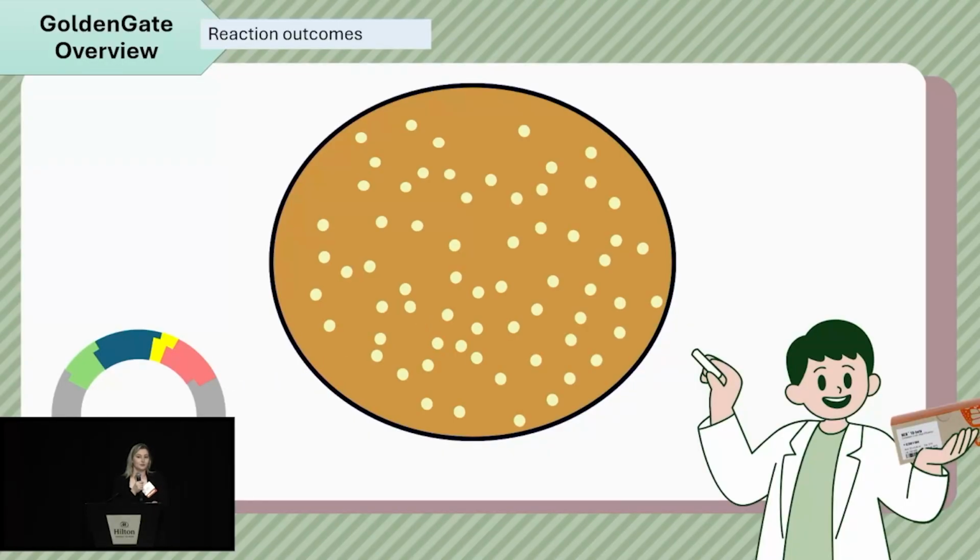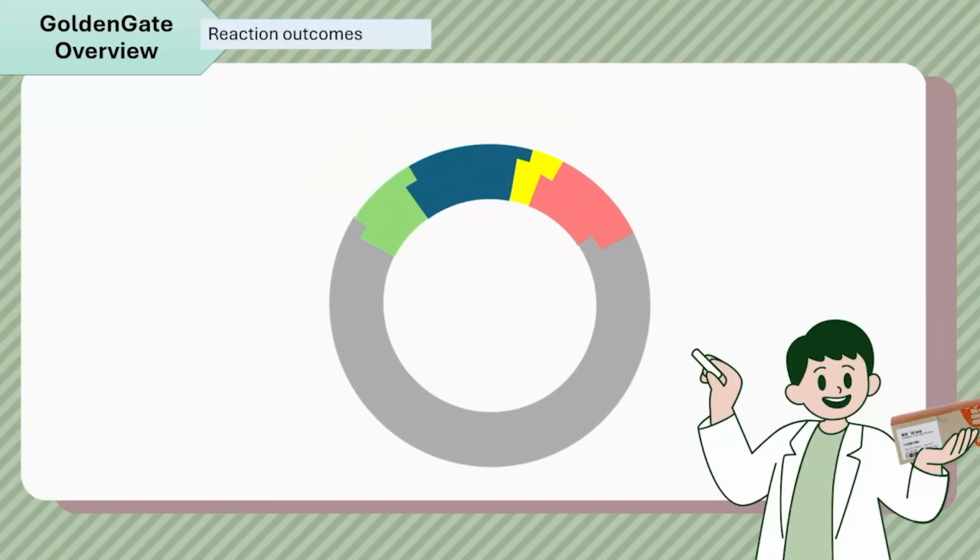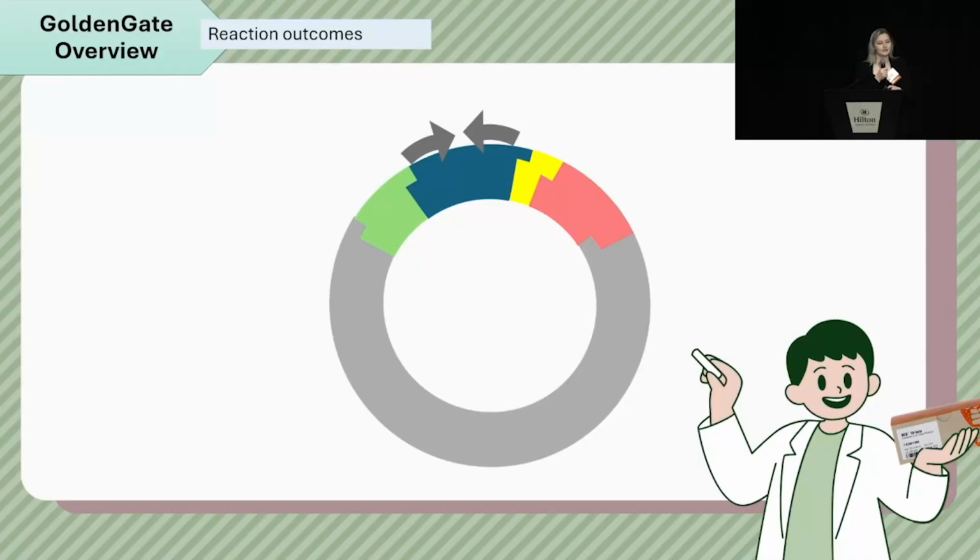Now, it's hard to tell which of these E. coli will actually have it. So just remember that when you're doing your PCR screening, that you shouldn't use primers that are just in one of the inserts. You can use ones that would span multiple inserts, but what's most recommended is using one primer in the backbone and one primer in your insert.